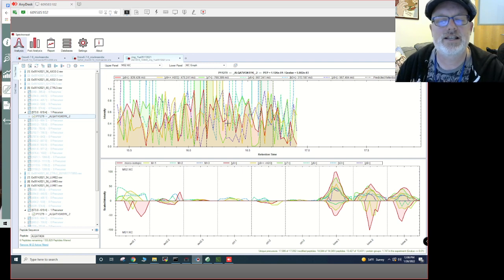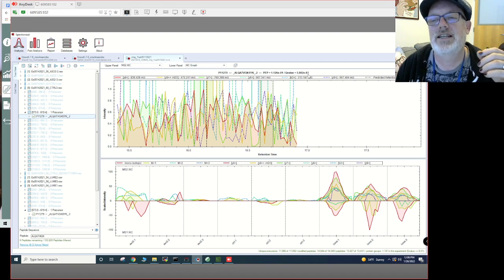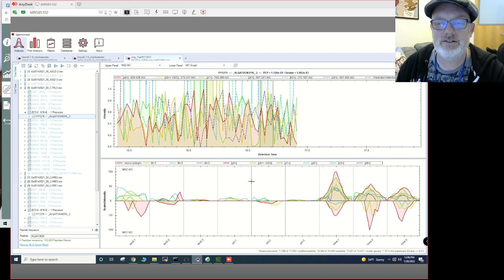And you can see the difference. That's really just picking stuff out of the noise. It has a Q value just below the cutoff, 5 times 10 to the negative 3. But you can see it's really not a good signal. So I'm really happy these are in LLUME and not in the other ones. We don't see any evidence for it.